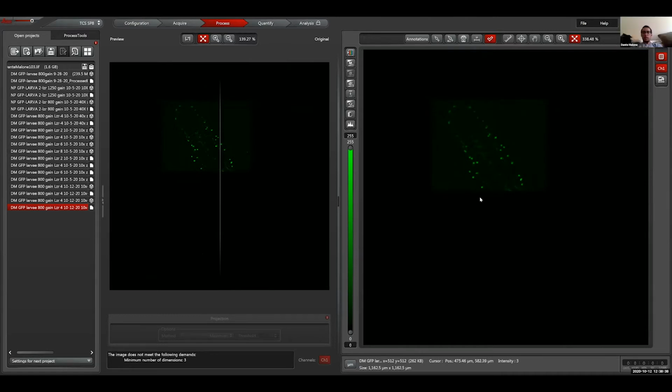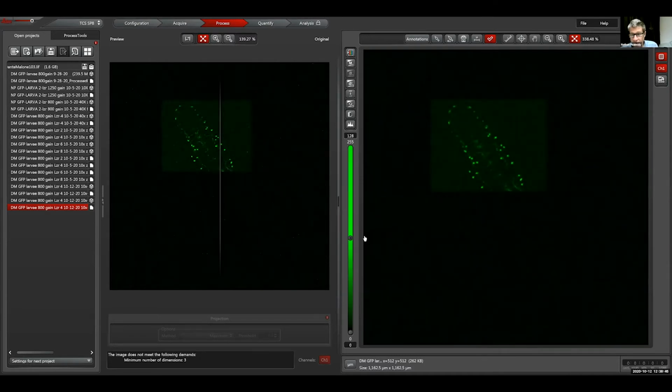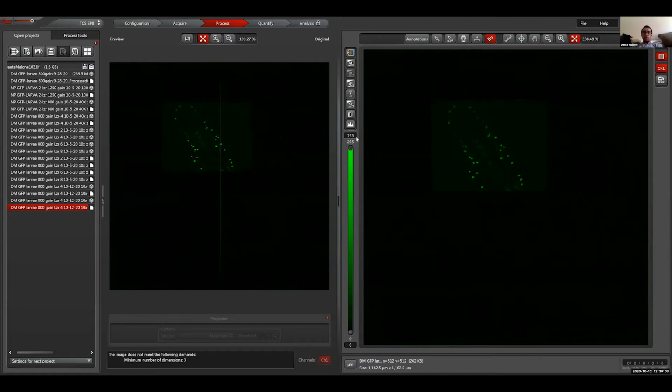Yeah. It's a little grainy. If I change the LUT, you can see it better. But now it's only that rectangle that we wanted. Right? The rest of the brain is down here. And then there was a bunch of extra fuzzy parts in the sample that I didn't care about. Okay? That makes sense? Yeah. All right.